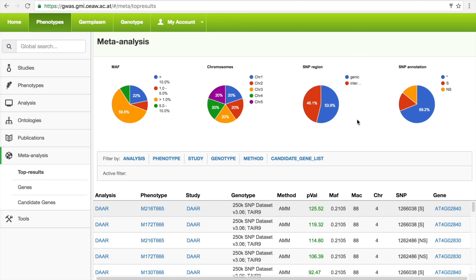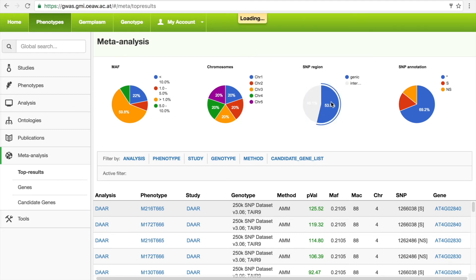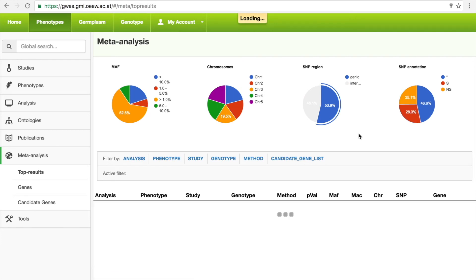The user can drill down into this huge list by clicking on a slice of any of the pie charts. For example, we are only interested in genic SNPs, so we choose the corresponding slice which filters the list to 1.5 million SNPs and updates the table.